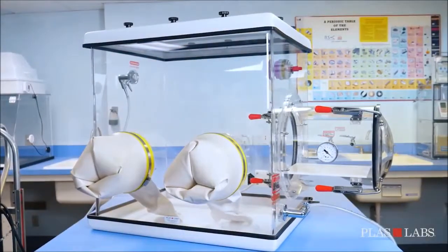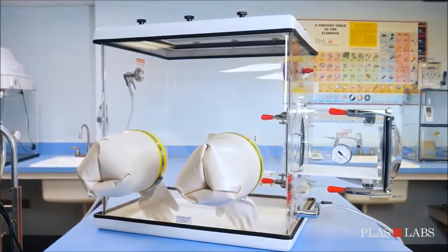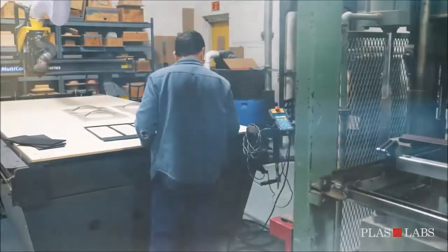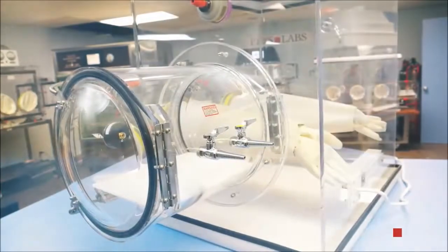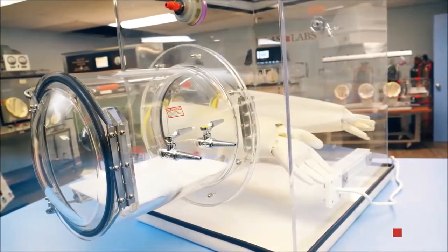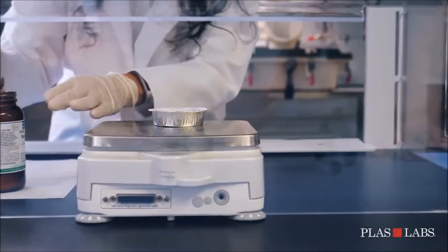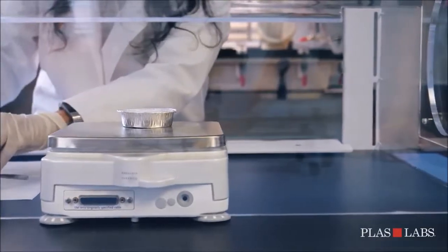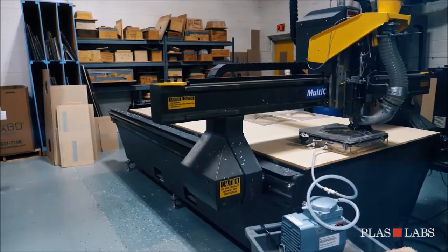The 830 series compact glove box is one of several fine products offered by Plaslabs. Our 50-plus years of experience will help you produce results. Conception, interpretation, production, and satisfaction is what makes Plaslabs the world leaders in acrylic containment and isolation technology. We work closely with individual research scientists to design and manufacture custom one-of-a-kind units for their specific research needs.